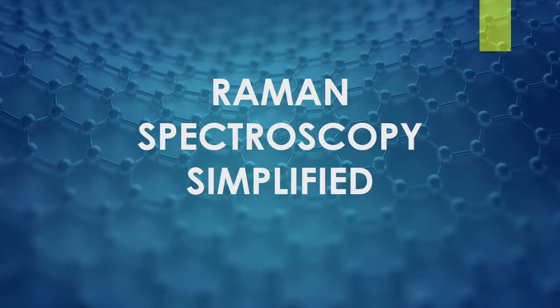What is Raman spectroscopy? Before we get into that, let us look into how light of considerable energy affects a particular atom or molecule.